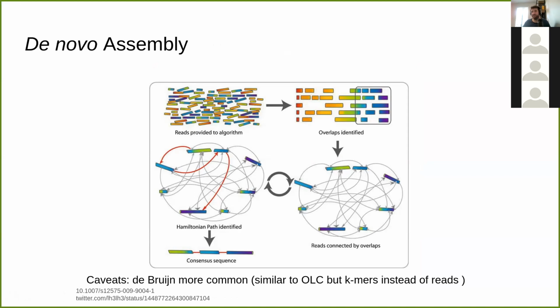In fact, there is one in the Canadian Bioinformatics Workshop on genome assembly. But essentially, the very rough idea, and this is one particular paradigm, another more common paradigm is called de Bruijn graph assembly, but they're approximately the same idea. There are just some quirks and differences in the way they actually work. Essentially, we take all our reads, and either by splitting everything up into k-mers and comparing them, or just looking directly at the reads, we look at how they overlap with one another. Then we can use that to make a graph that has all the connections between these reads. This is an assembly graph, you might have heard that term. And then we navigate paths in that graph to pull out those contigs.